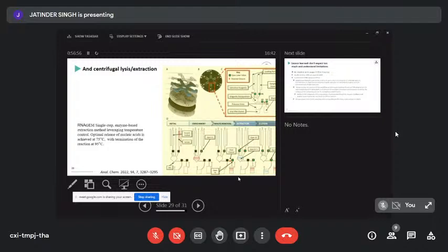After you spin it a little bit louder, a little bit harder, one of the valves is opened, and you get the red liquid to be moved to the waste. So first, that one is being popped, the red liquid can go down. Then that one is getting popped, the liquid gets spun to waste because the particles that sit there collect, in this case it's COVID, so collect the viral sample.